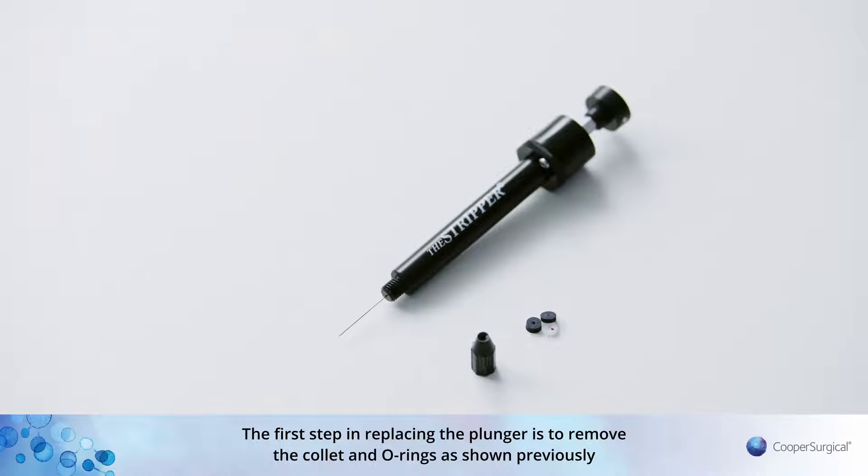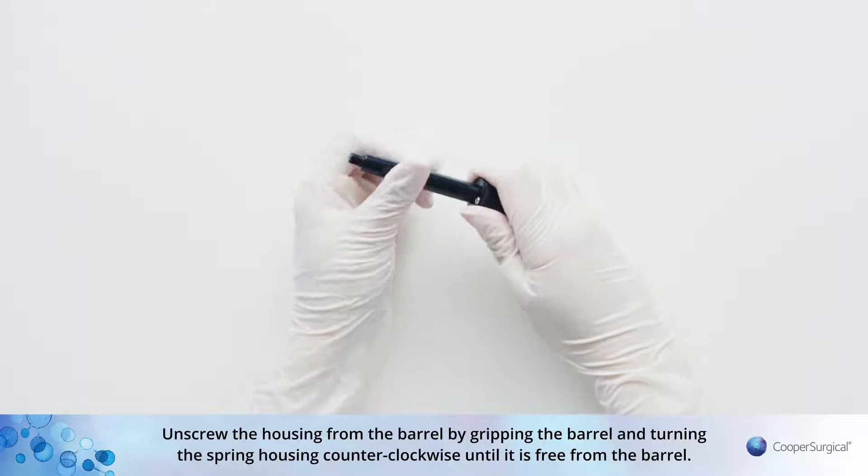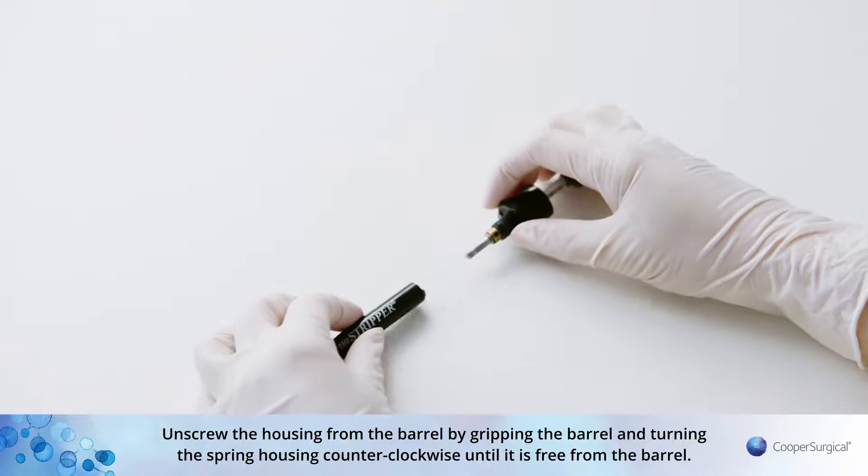The first step in replacing the plunger is to remove the collet and O-rings as shown previously. Unscrew the housing from the barrel by gripping the barrel and turning the spring housing counter-clockwise until it is free from the barrel.